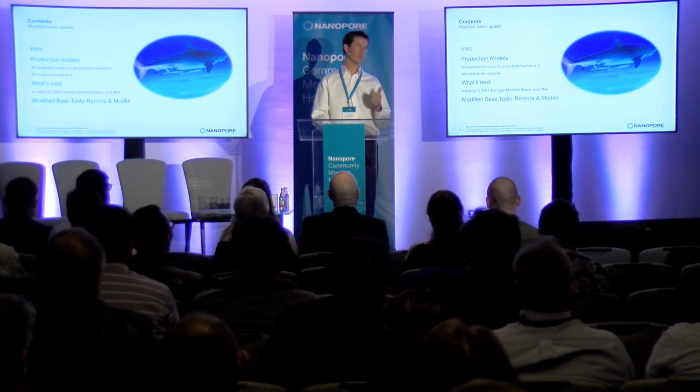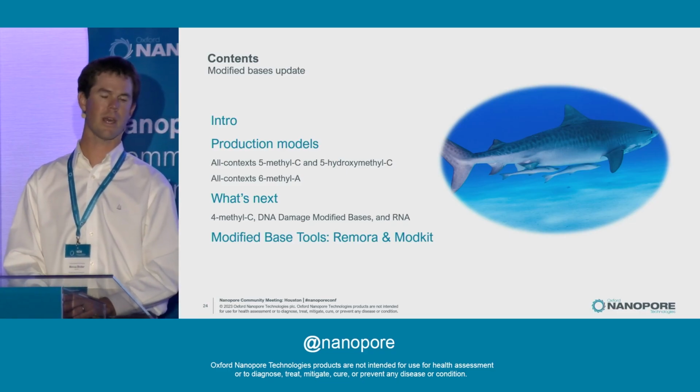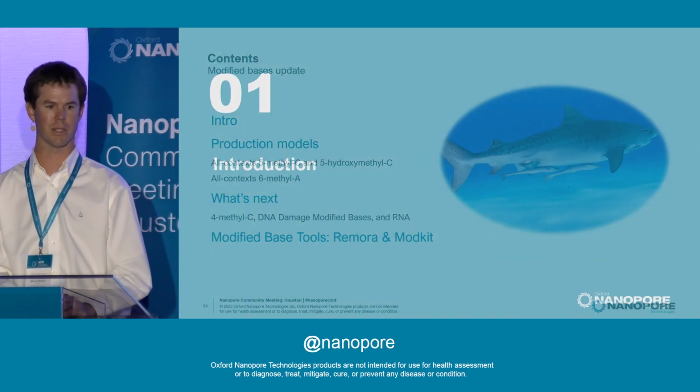Awesome. So I'm going to be giving you an intro to modified bases and methylation in Nanopore, touch on the production models that we have, what's coming next, and modified base tools for downstream analysis, which is a big new focus for us now that we've sort of grown the catalog of modified bases.